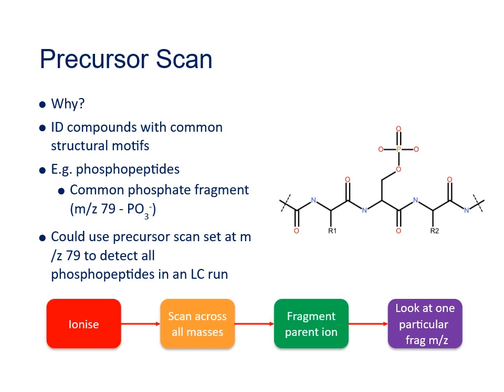And a great example of this is phosphopeptides. Phosphorylation is one way that your body turns the action of proteins on or off. So being able to identify which proteins are phosphorylated in a given sample can provide really important information about the biochemical environment that sample was taken from. For example, giving information about how a disease works, or how the body is responding to an injury.